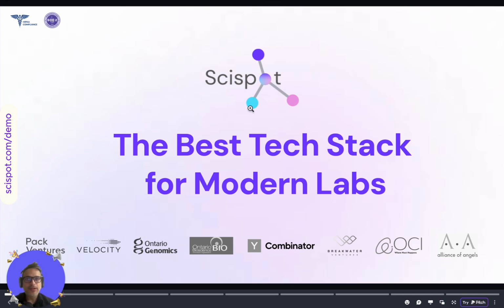How to link various disparate data together when it comes to experiments, instruments, plate data. Some of the topics that I'll cover today are what's wrong with lab databases today, and why biotech companies struggle to connect data with generative AI in full swing. If you don't have your data model fixed, it's really hard to use LLMs or any of the AI engineering on top of these data models.